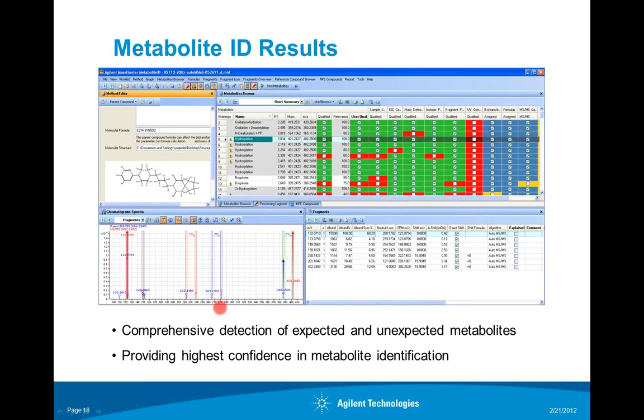In this case, these two fragment ions have been shifted. It will also indicate how many mass units have been shifted, and also indicate the possible biotransformation. In this example, the possible biotransformation is oxidation. This table will list all the m/z values of the fragment ions and the mass shift. In this case, the mass shift is 16 mass units.